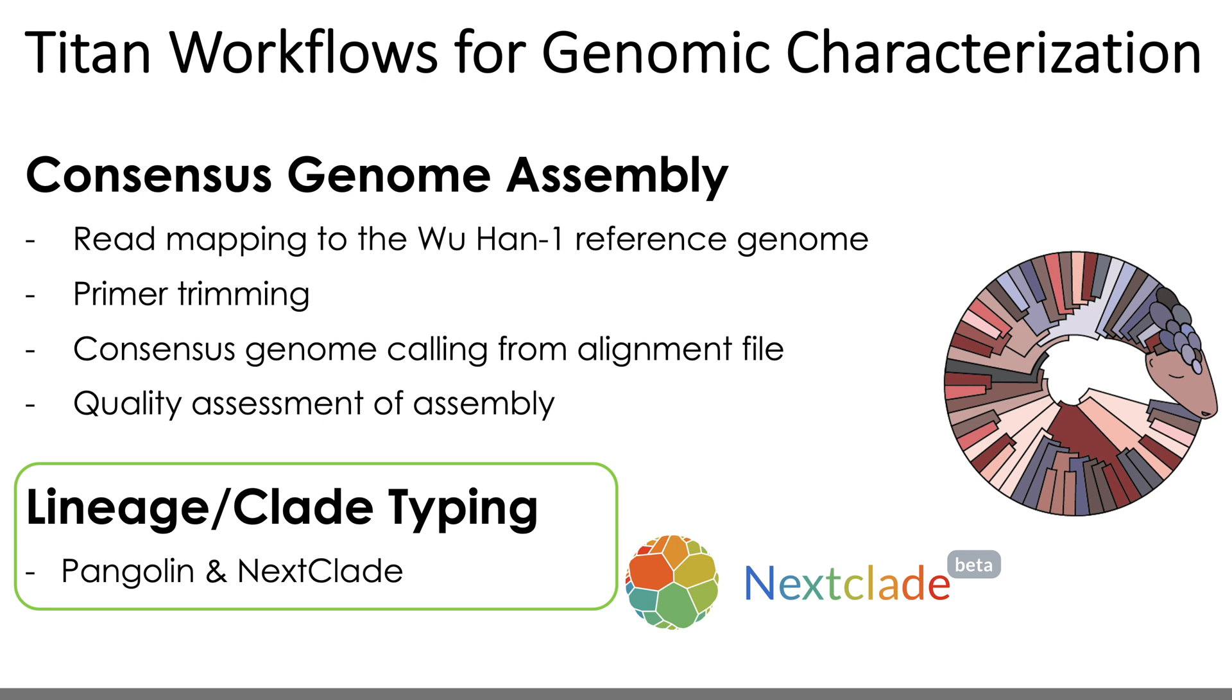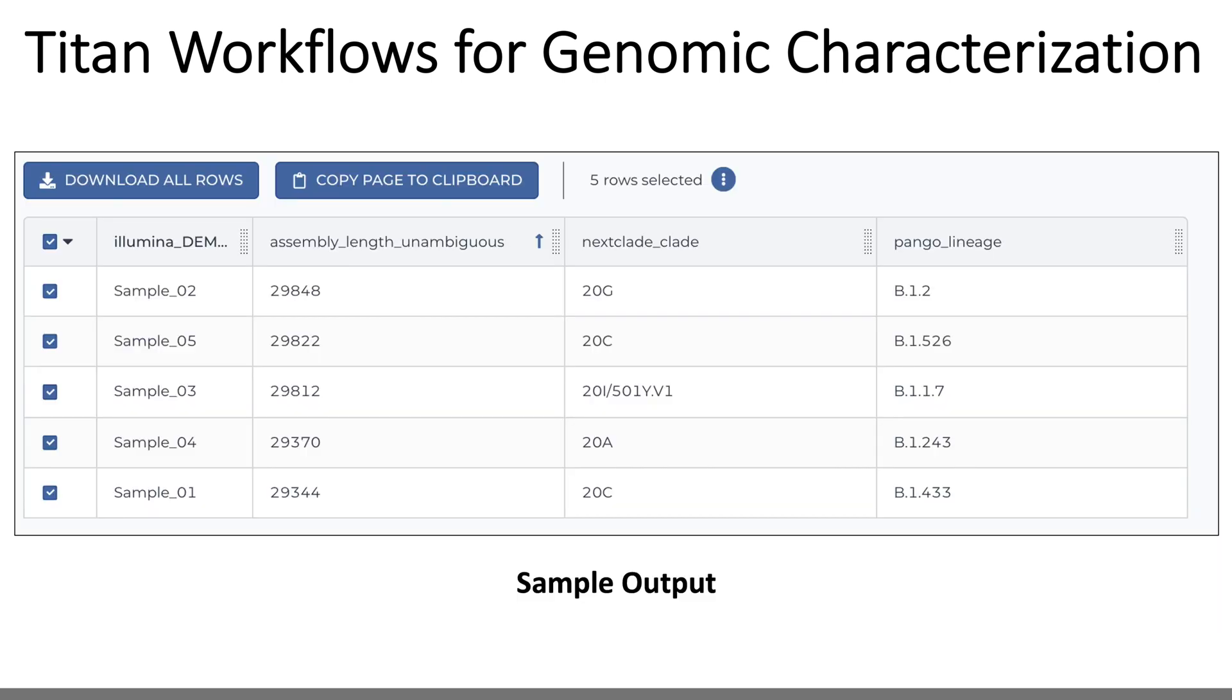For now, as an introduction to these workflows, just know that these are the general categories of outputs generated by these Titan workflows, and that from your Terra workspace, you'll end up with a data table that will be populated with these outputs. And these tables can be assessed within the Terra environment itself, as shown here, or exported to Excel for further analysis and sharing.